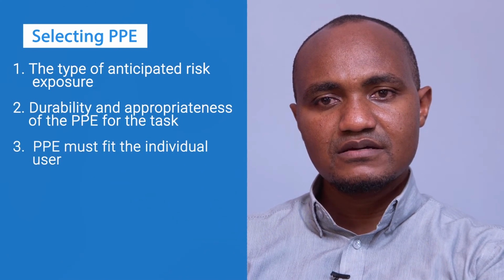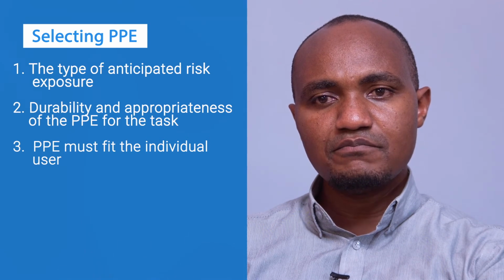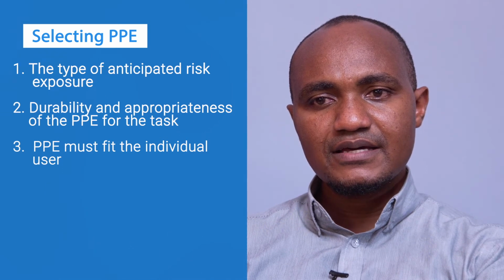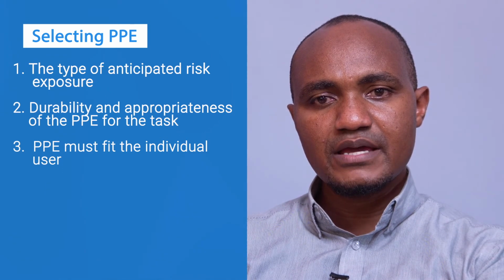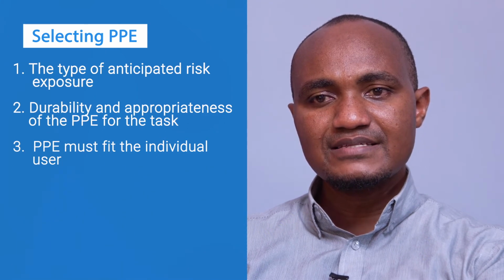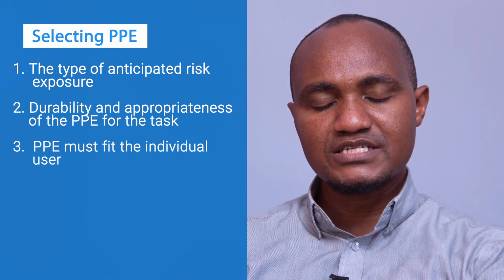Third is fit. How many of you have seen someone trying to work in PPE that is too small or large? PPE must fit the individual user, and it is up to the employer to ensure that all PPE are available in sizes appropriate for the workforce that must be protected.